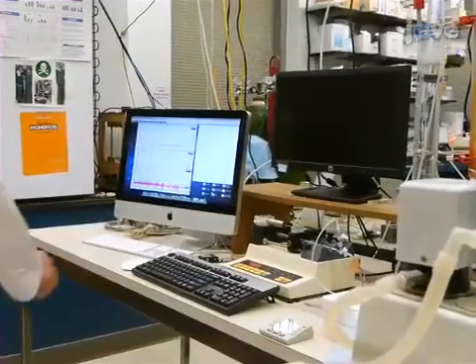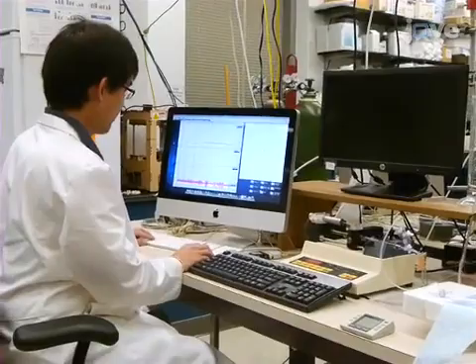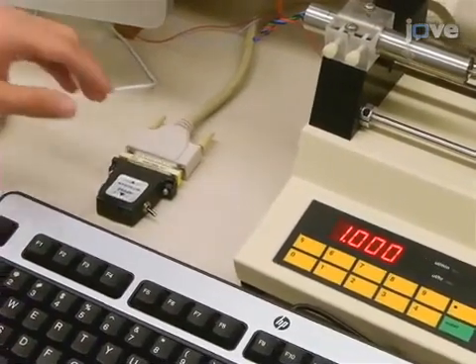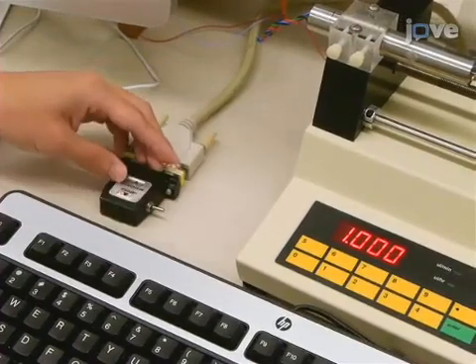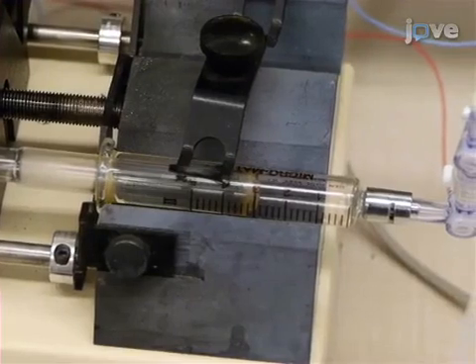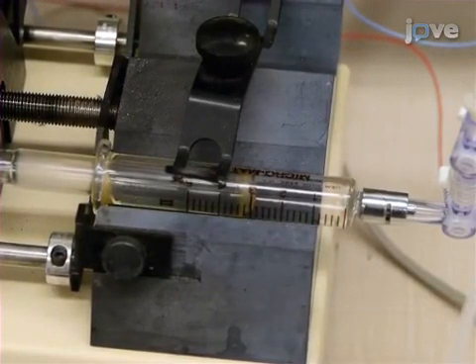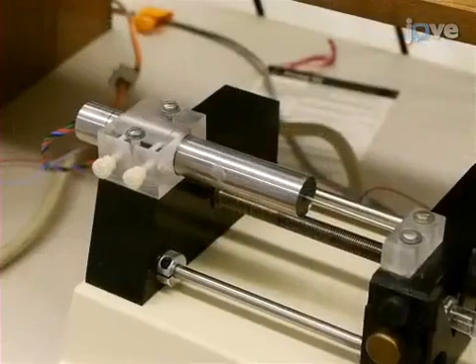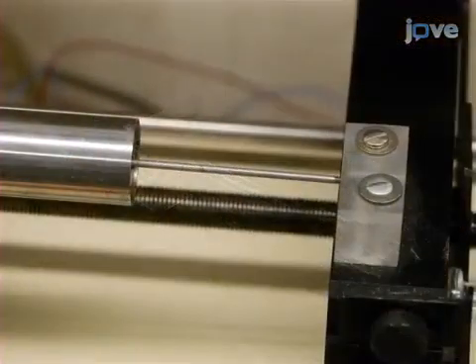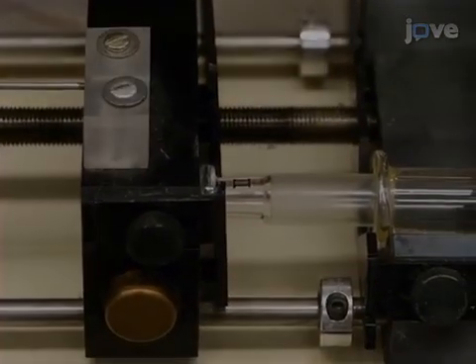For measurement of the lung volume, use a syringe pump with a switch that allows a quick pump reversal after the pressure limit is reached to generate a constant rate of inflation and deflation of the lung. For mouse pressure-volume curves, use a 5 milliliter glass syringe with the prior to inflation volume set at 3 milliliters of air. Attach a linear differential transformer to the pump housing, with a small sensor rod connected to the moving syringe plunger, and measure the volume delivered by the pump.